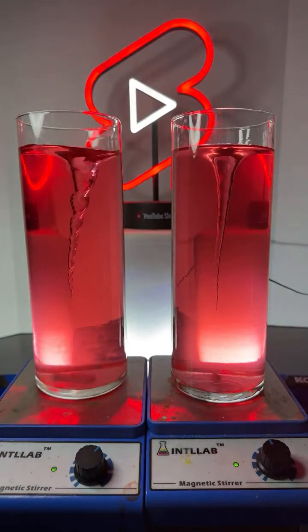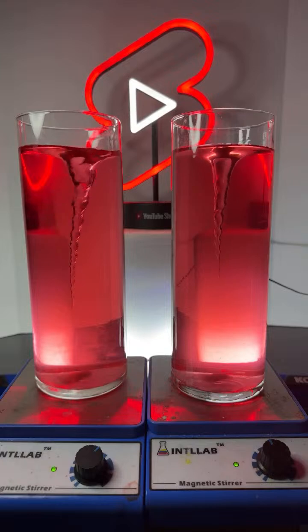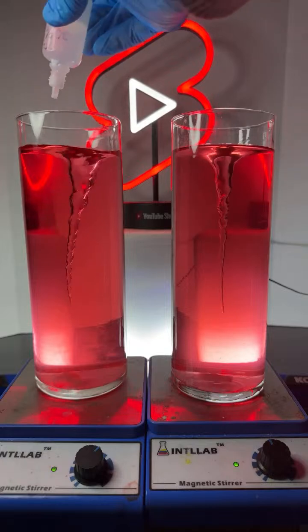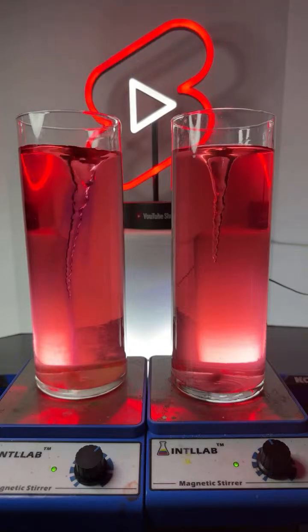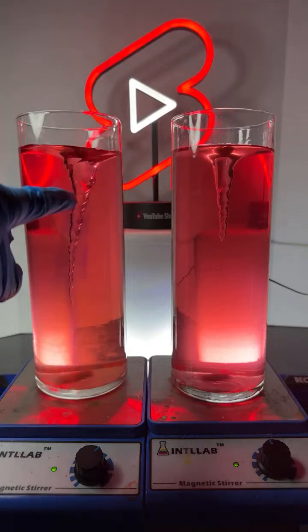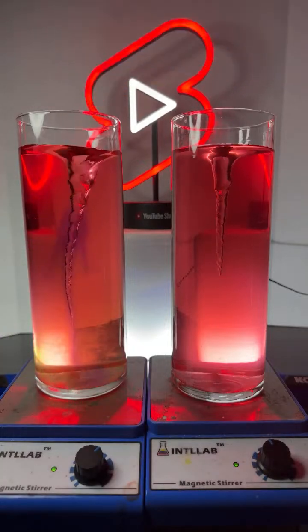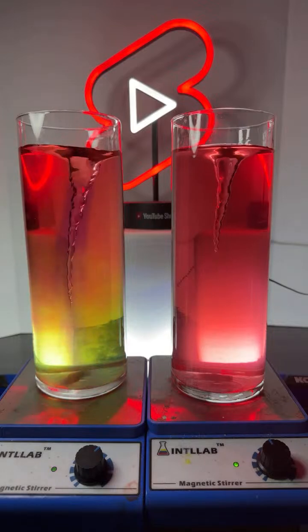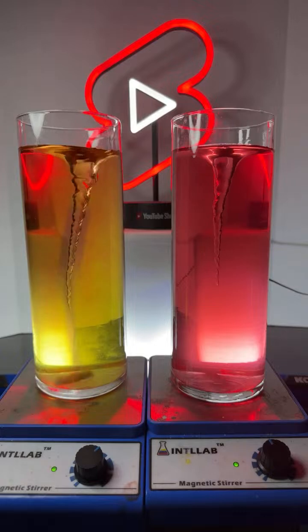Gigabean says, any religion is good, but I prefer facts and reason over faith. Yeah, some folks think that way. Sure enough. Okay, I'm now going to add a drop of base to the left. Here we go, 1 drop. You might have seen a little bit of blue color develop in here. Let's add like 2 more drops. 1, 2. Developing some green on the bottom. You can see blue in the vortex.